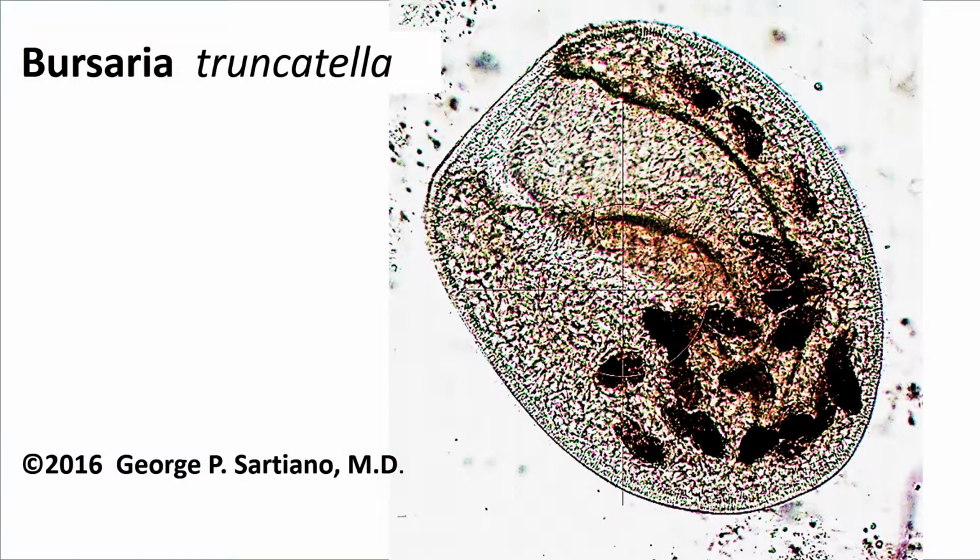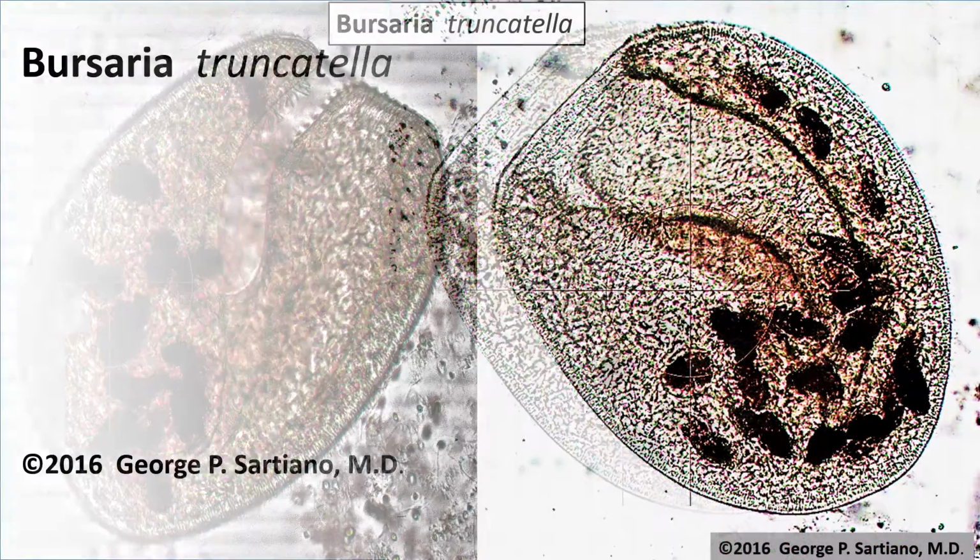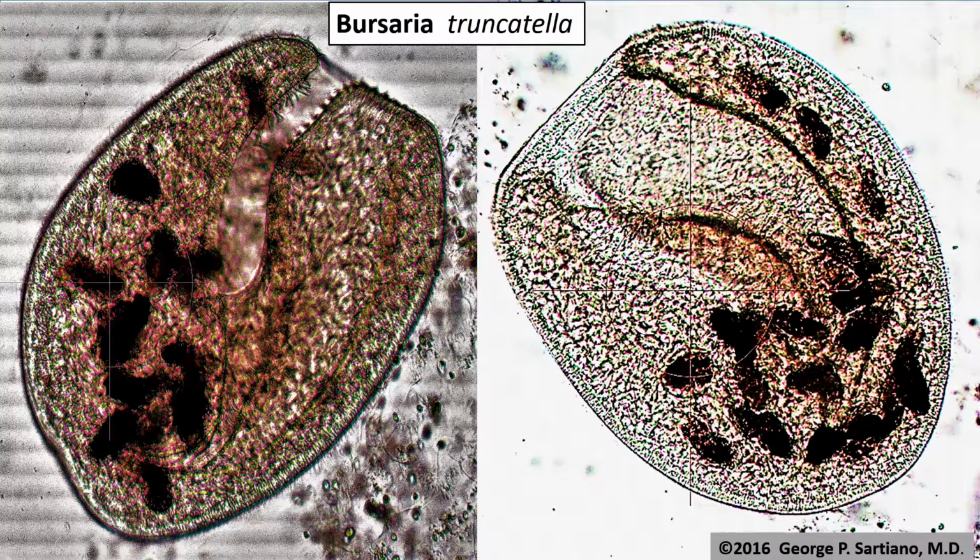Bursaria truncatella. Bursaria truncatella.